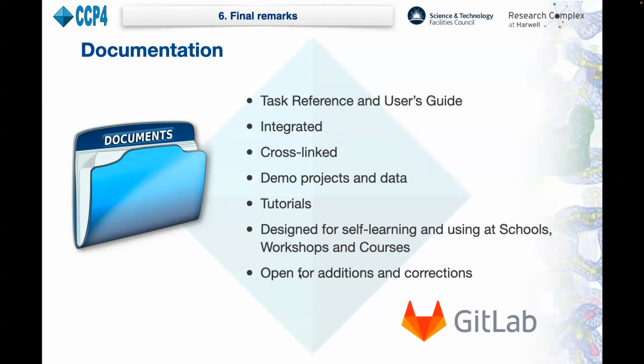The documentation repository in GitLab is open for all contributors, and everybody is invited to join the documentation project. Here, the possibilities are really endless. For example, if you need CCP4 Cloud for your university courses, you can put up your tutorials on the cloud and use them right from there.